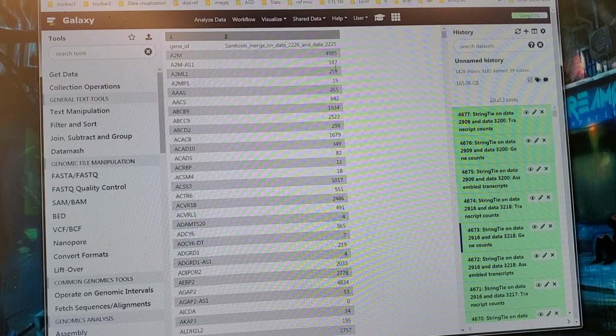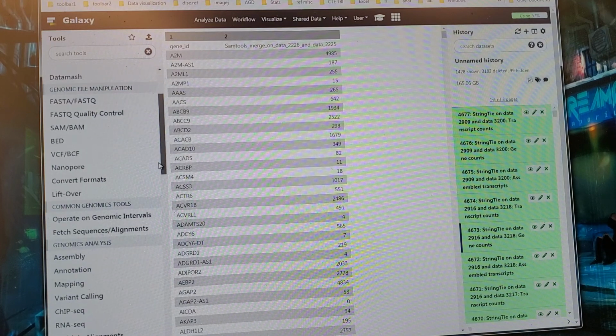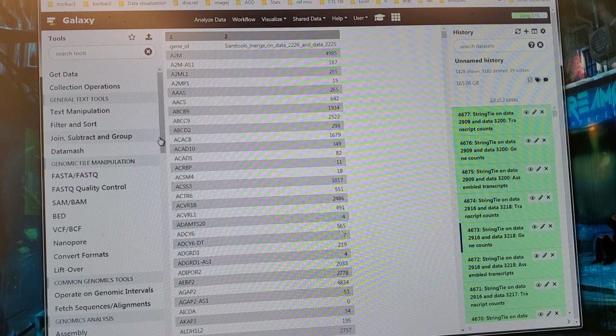And once you get all of these raw counts, you're going to put it into something that does differential expression analysis. Differential expression analysis basically takes into account all of the questions you could ask, like, what if this is because of this? What if this is because of that? It's not foolproof and it's always evolving. There are tons of differential expression softwares, and which one you use and which one works is sometimes a matter of taste. There are some really bad ones, there are some really good ones.